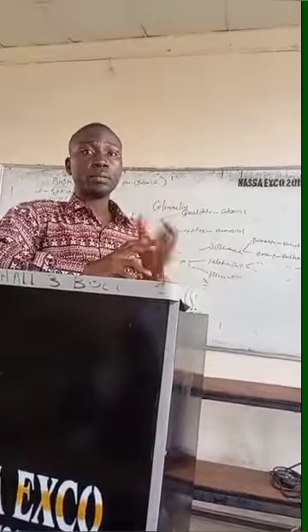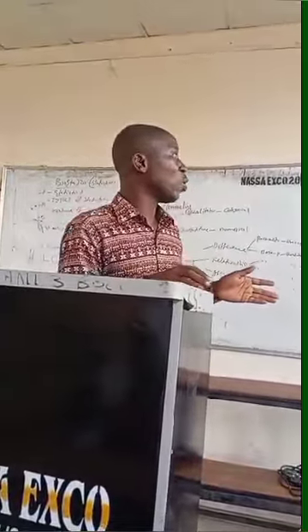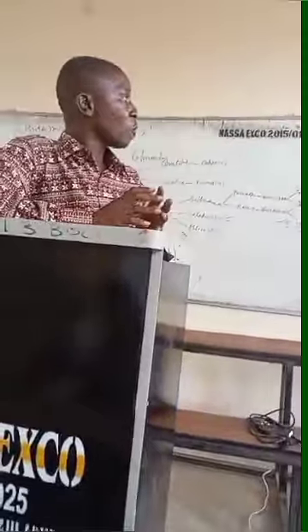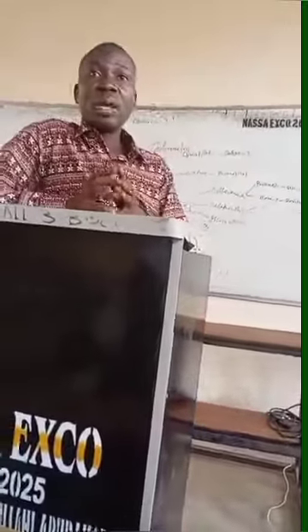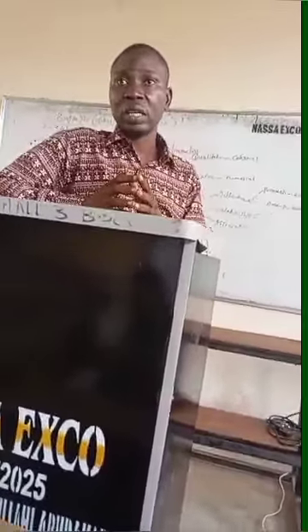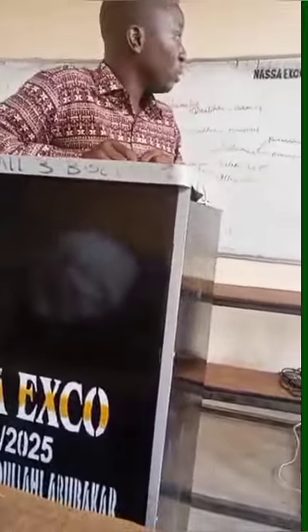Now, detection limit. Detection limit is related to sensitivity. There's a relationship between them. But detection limit here is the lowest analyte concentration that can be reliably distinguished from background noise. So that minimum concentration that the machine can detect, which can be distinguished from background noise. Normally, background noise is something that is inevitable when it comes to chemical analysis. But if you have the ability of that machine to identify that concentration, reliably distinguishing it from that background noise, that is actually what the detection limit is.